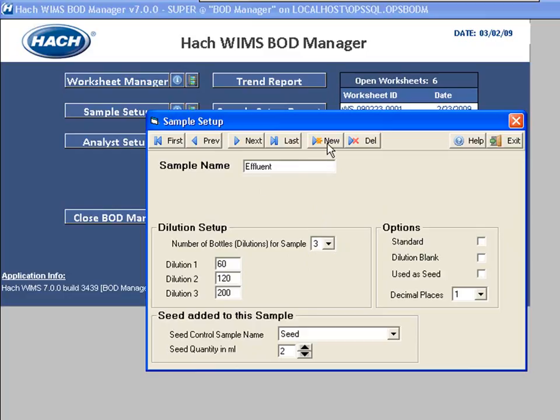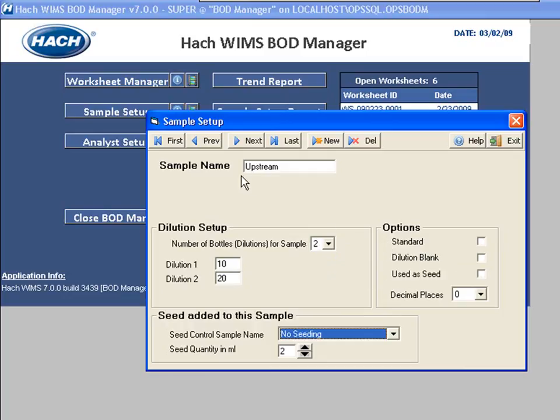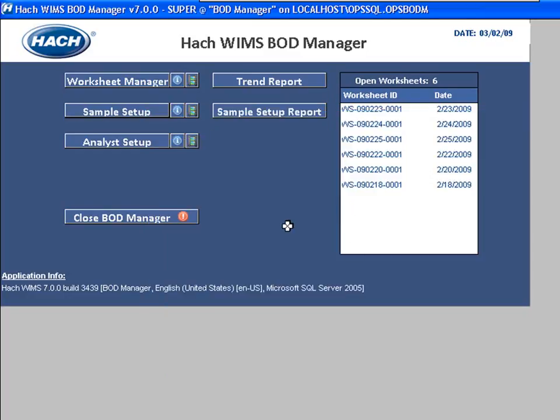To create a new sample I just click New. Let's say I've got to do an upstream sample — I type in 'upstream,' choose how many bottles I want to run, let's say two, with dilutions of 10 and 20. I don't seed it, so I check no seeding. None of the other options apply. I can exit, and any way that I move off that record it's saved. That's all there is to sample setup — thank you.